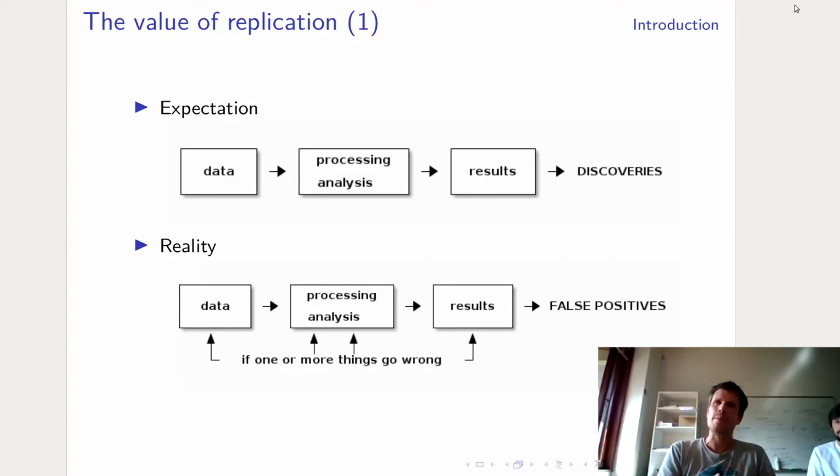Now, of course, it's really important to emphasize that replication isn't a guarantee for accuracy, but an analysis that can't be replicated is one that can't be trusted. So replication is the first step towards trustworthy and shareable analysis.